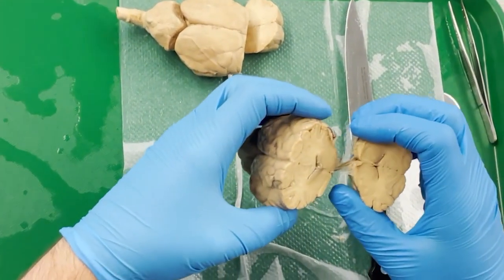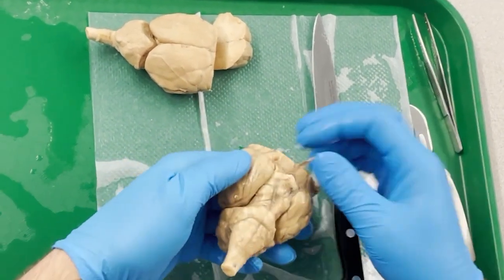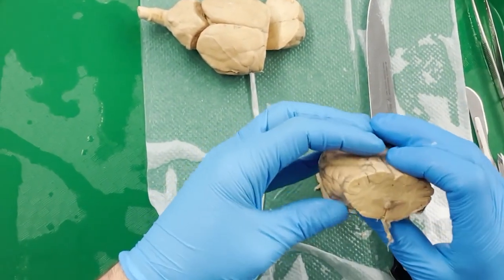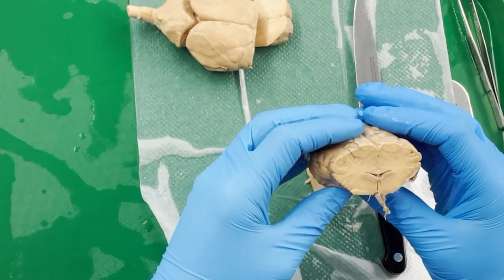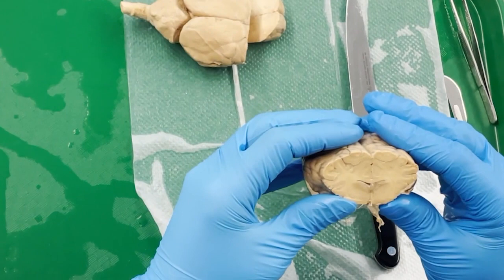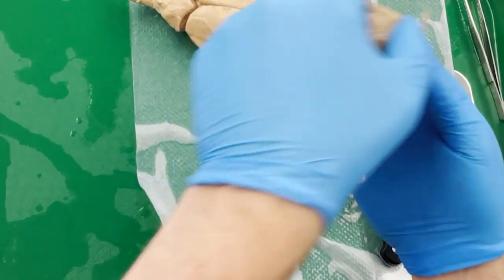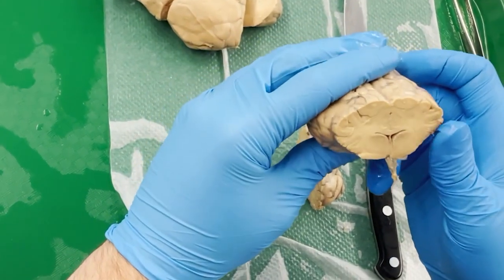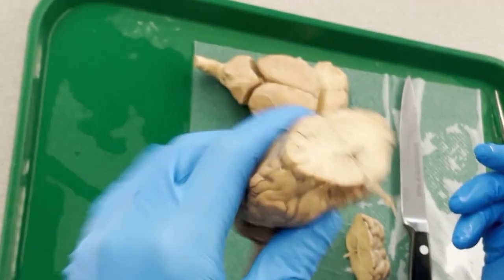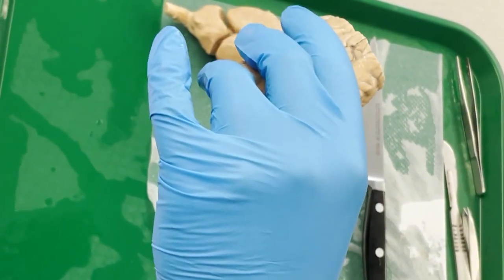Okay, so I made the cut. Just pull that apart there. It is anterior of the optic chiasm, and what we'll end up seeing is this interesting, almost three-way split. So the two hemispheres will kind of come apart a little bit in the center here. Yes, so I just drained out the lateral ventricles seen in here, those two little crescent shapes up there.